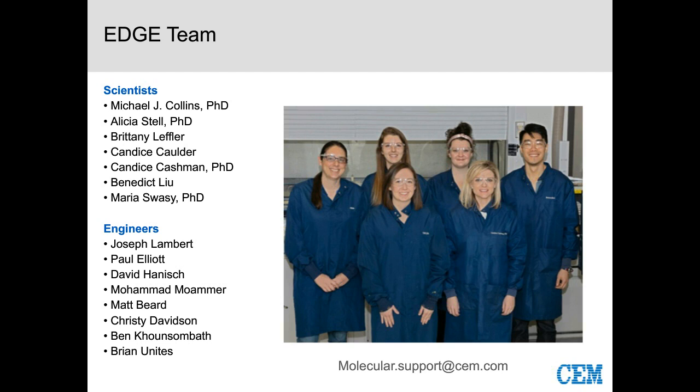Why was carbon black not used in the soil samples? Do you think that would have improved the data? Yeah, and actually that's a good point. I didn't really get into the details on that at all. For everything that we did here, it was just straight sample, no carbon black, and we wanted to go as simple as possible. So we want to start at the ground with sample and then work our way up. That would be part of our next study, to add the graphite carbon black. But yeah, I think there is a possibility that it could even improve the recovery. So yes.